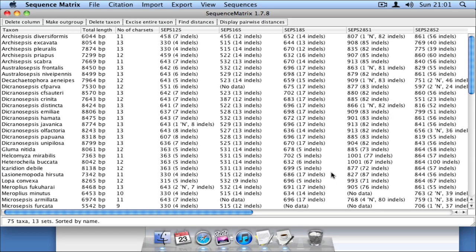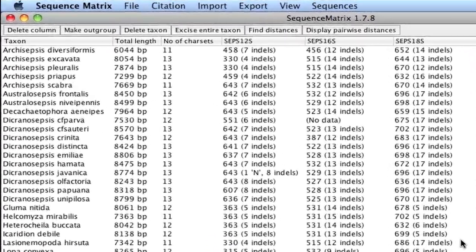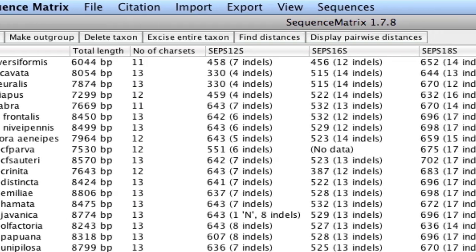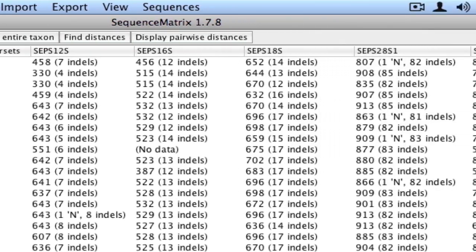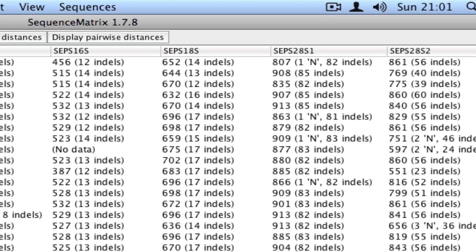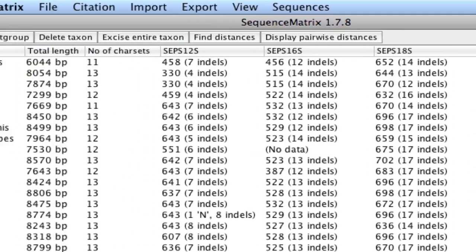Now that all the files are loaded into memory, let me explain the Sequence Matrix interface. The taxon names are on the left, and the name of each marker or gene, which was the name of the individual Nexus files, is at the top of each of the columns.